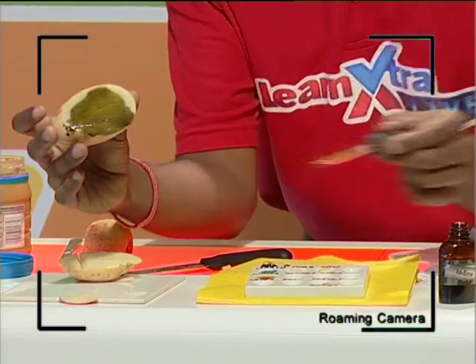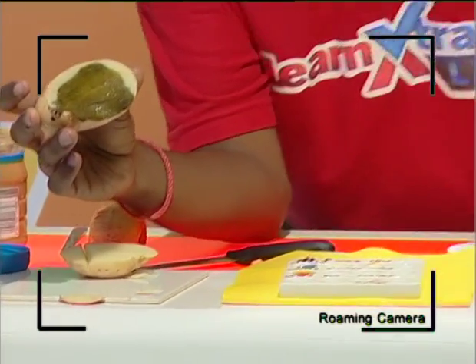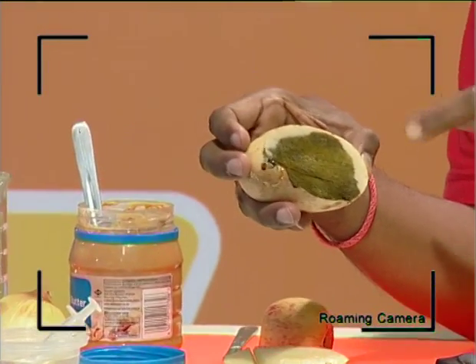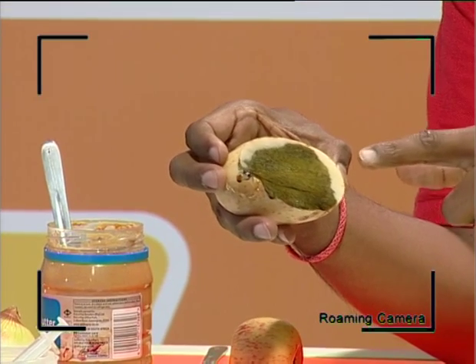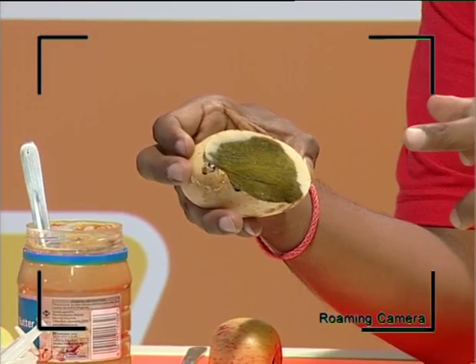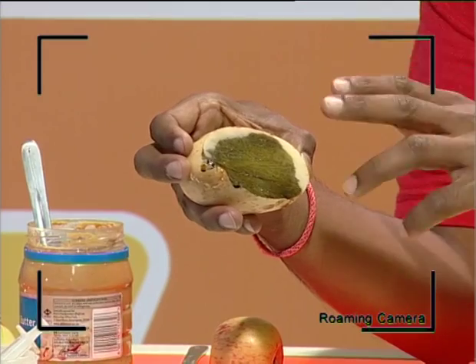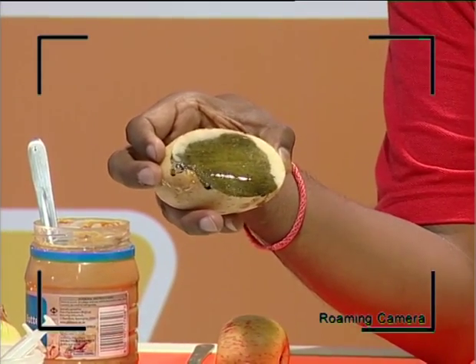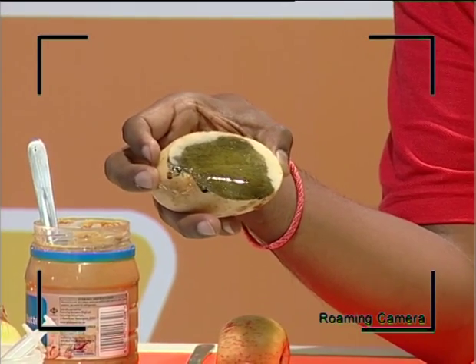The color of iodine here, guys, is normally yellowish brown. In the presence of starch, iodine will turn a dark black or bluish precipitate, and you can see it's a dark color. And this would be the positive test. If we look at the different wells, guys, we can clearly see the color change, and you've got to look very quickly.